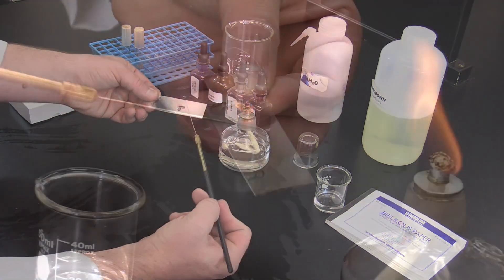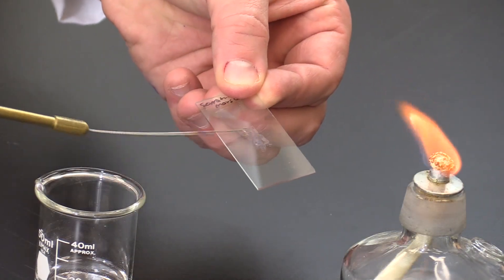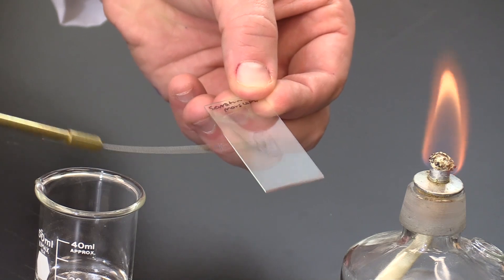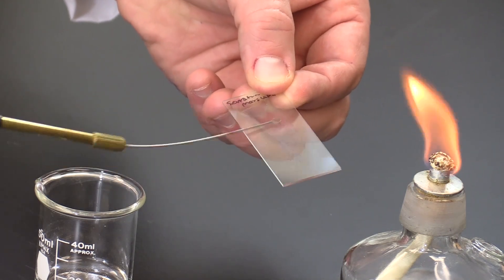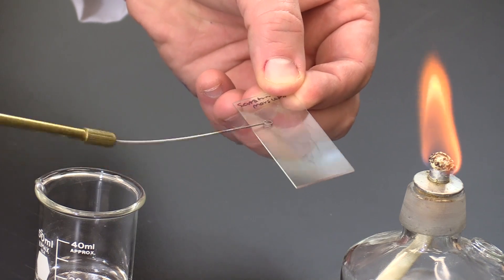Next, pick up the slide and add the bacteria to the water droplet. Mix and smear into a very thin layer. Creating a thin layer promotes drying as well as reducing clumps of bacteria.